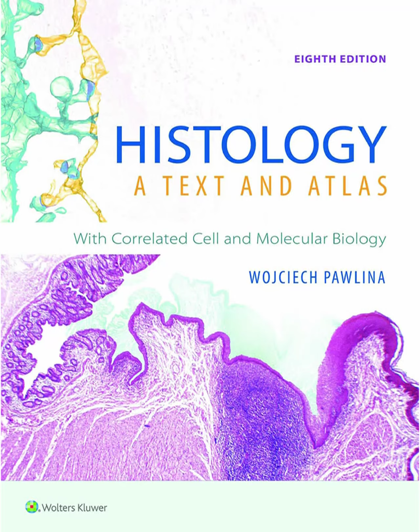What a journey. A rapid but, I think, fascinating tour through the incredible methods behind histology, from preparing a seemingly simple H&E slide, learning about frozen sections, specialized stains, immunochemistry, FISH, all the way to the cutting edge of expansion microscopy, super-resolution light microscopy, EM, and even AFM. Each technique really does peel back another layer of complexity, doesn't it? Helping us understand that intricate dance between structure and function at the microscopic level. It truly is a journey from the invisible to the profoundly insightful.